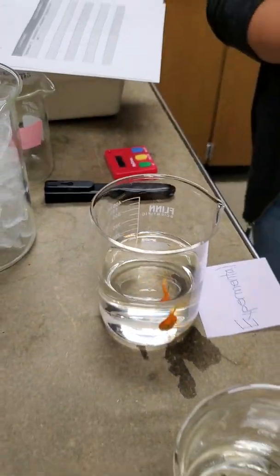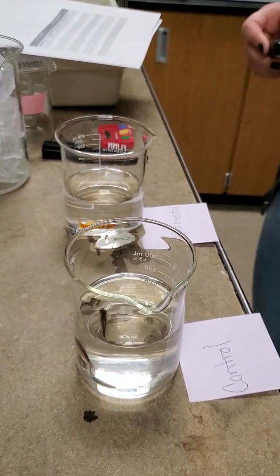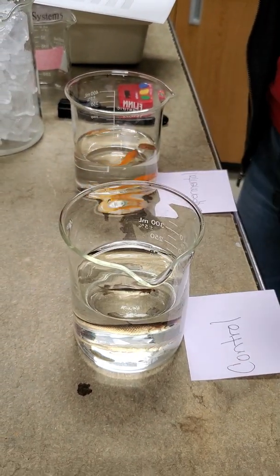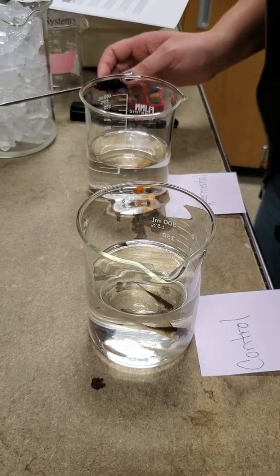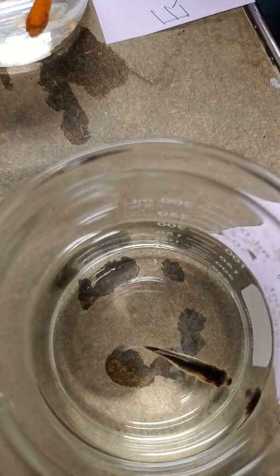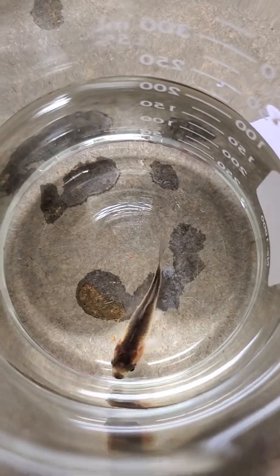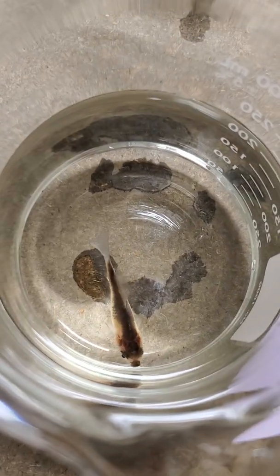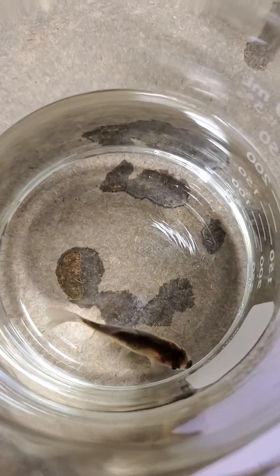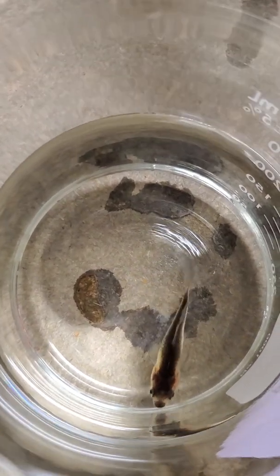All right, so now the first thing we are going to do is for the control goldfish, since you now have the baseline temperature, and you can rewatch this video to get all the information, I'm going to put the camera over the control goldfish and start the timer for 30 seconds. I want you to count the respirations either in the reflection that you see by his mouth moving up and down or by his gills moving in and out. Okay, we're going to start that 30 seconds, and I'm going to put some ice in our experimental goldfish.